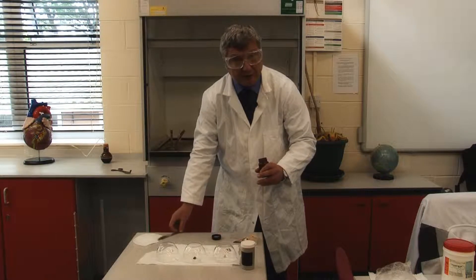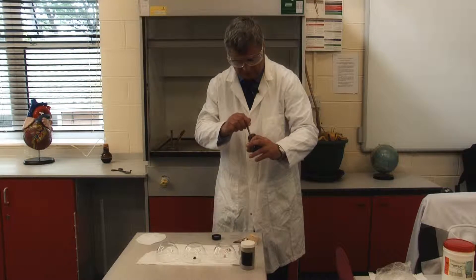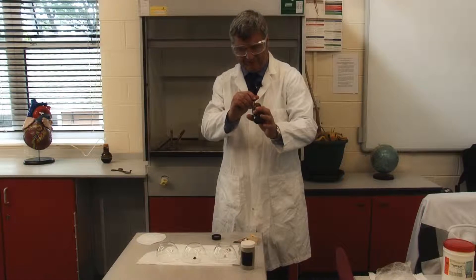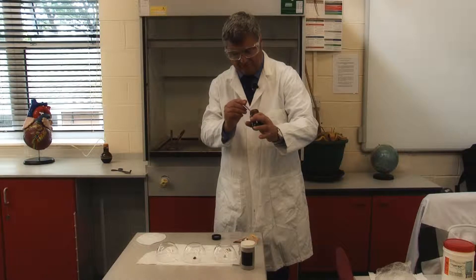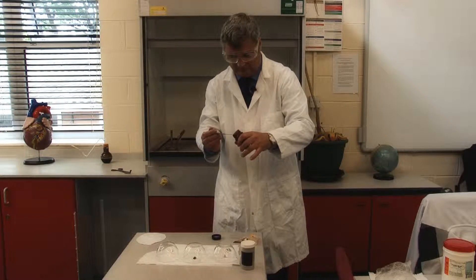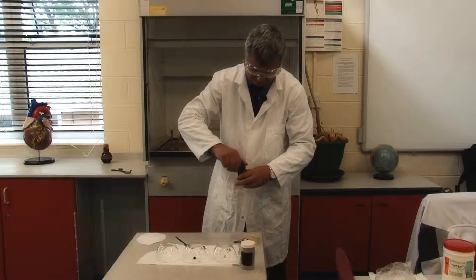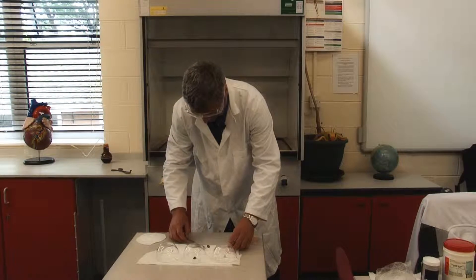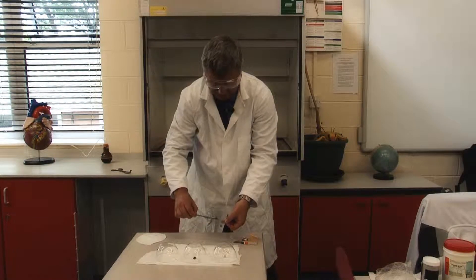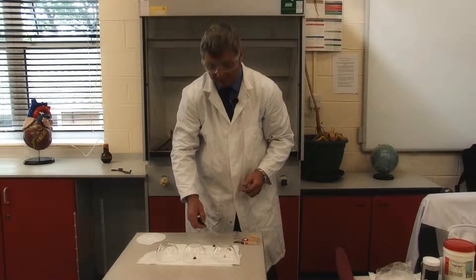As before, we take out a small piece of potassium. If you look at the size of the piece I've taken in comparison to a 20 pence piece, that should be enough there for a couple of demonstrations.